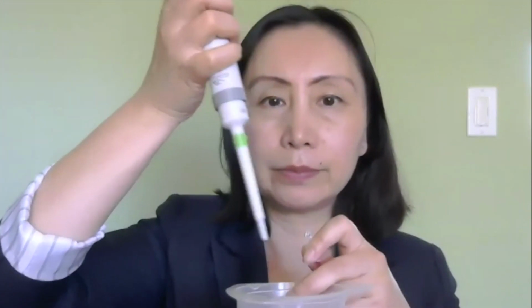Press your thumb down all the way to the second stop, keep pressing, and back out. Then press this ejection button to change the tip. All right. Now you see in this PCR tube, I have this pink colored solution. That's everything you need for the PCR reaction, but your DNA template.